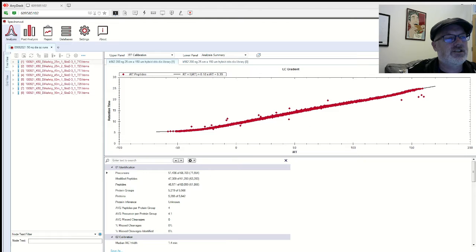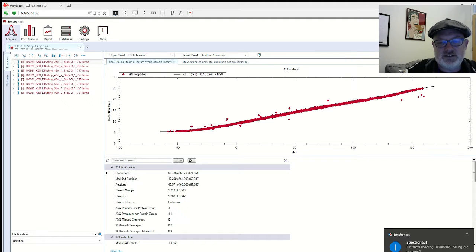But if you have like 100 files in here, maybe it can take like 10 minutes or so. Also, they do not have a viewer for Linux or a Mac, so if you have one of those, you're kind of out of luck. I believe you can probably get it on a Windows computer. I know it's kind of unfortunate. Or something in the cloud might work. I probably wouldn't recommend it, but if you want to look at your Spectronaut data, you're going to have to use a Windows box as far as I know.